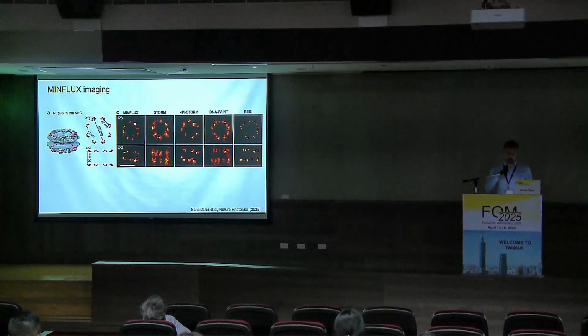For example, to take a 3D image of just, let's say, 10, 20 nuclear pore complexes easily takes an hour or two, whereas with localization microscopy, within 10, 20 minutes, you can have an entire nuclear envelope with, let's say, 1,000 nuclear pore complexes. So it's not clear if there are many biological applications where MINFLUX imaging is really more suitable than any of the other super resolution techniques at the moment. It really depends on your question and what you want to learn.